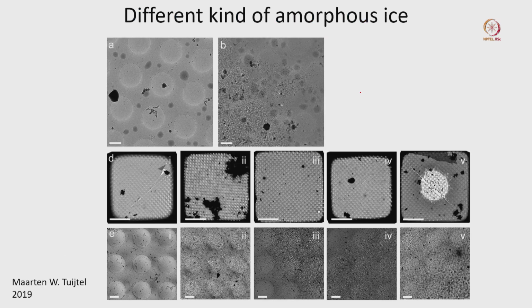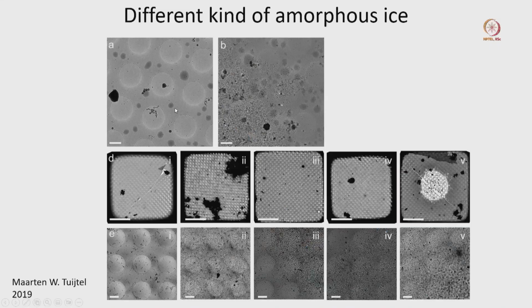Now I will show you an enlarged view of those holes where you can see different kinds of ice patterns, and we will discuss this more in a later slide. Here in this slide you can see these are the individual holes. There are some black patches. So whenever we focus somewhere in this particular region, it is in between those holes.